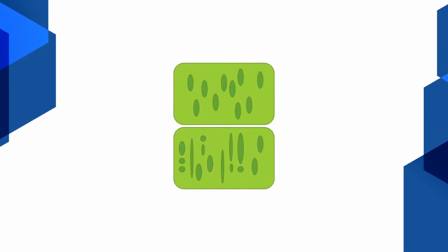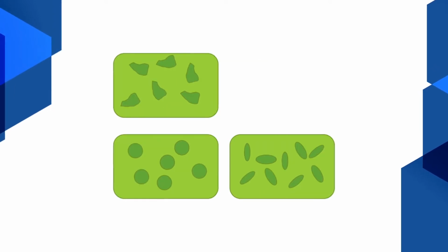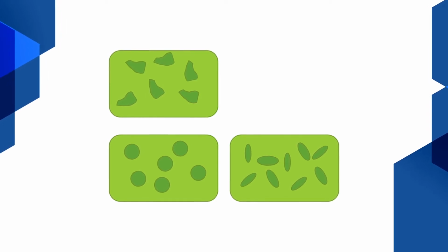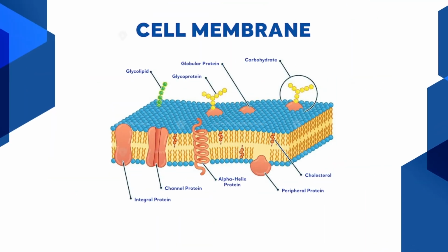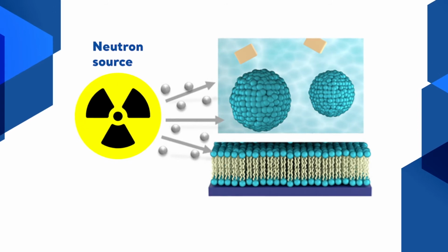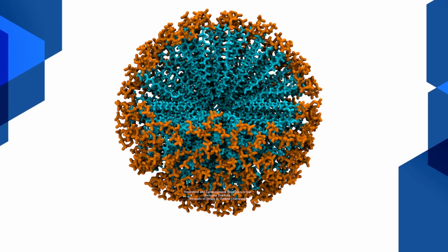The main condition that needs to be fulfilled for SANS is that the material must be heterogeneous on the length scale from 1 to 500 nanometer. Such heterogeneities can be, for example, nanoparticles, nano or micropores, nano-sized precipitates, micelles, polymers, macromolecules, membranes. Another important criterion is the contrast. The scattering length density of one component of the sample must differ from that of the surrounding.